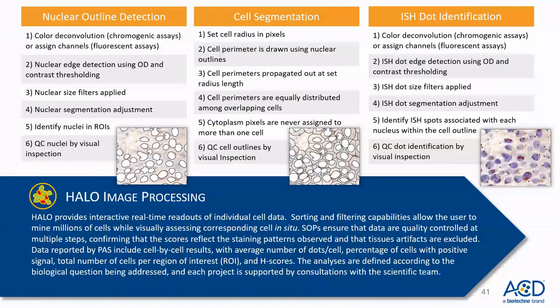So just to reiterate, no matter which approach you are taking, whether you're analyzing a chromogenic image or a fluorescent image, it's always important to realize that you will have to tweak the settings in every pipeline, including the thresholding method, etc., to your unique image attributes, because every image is different.